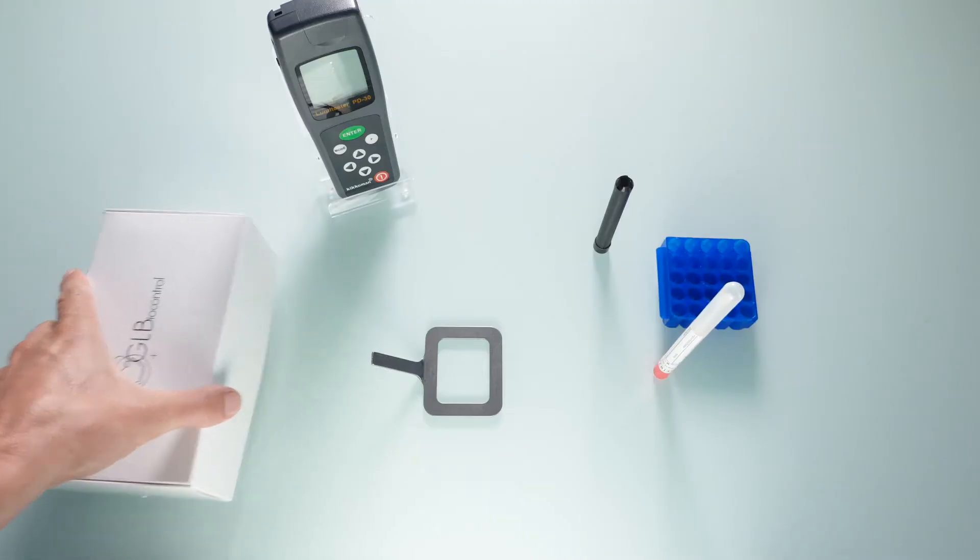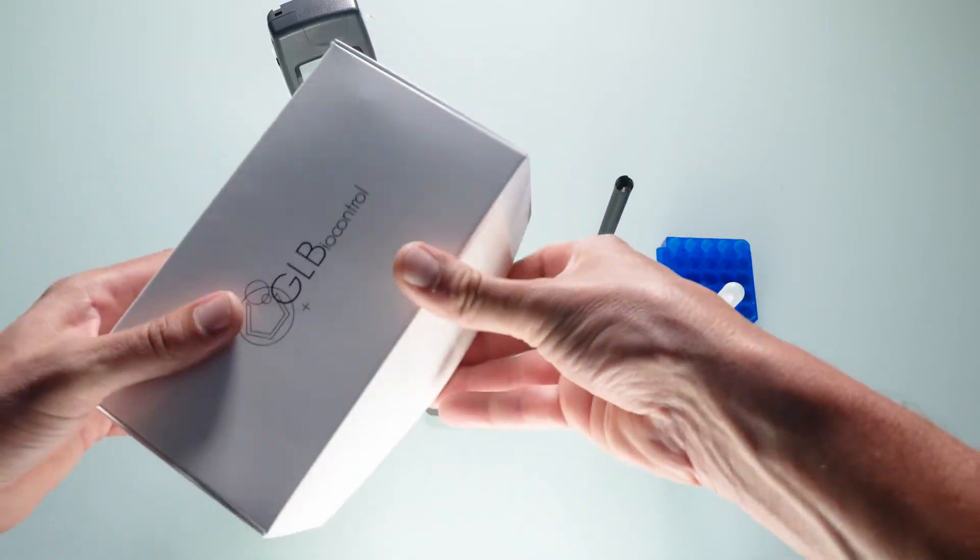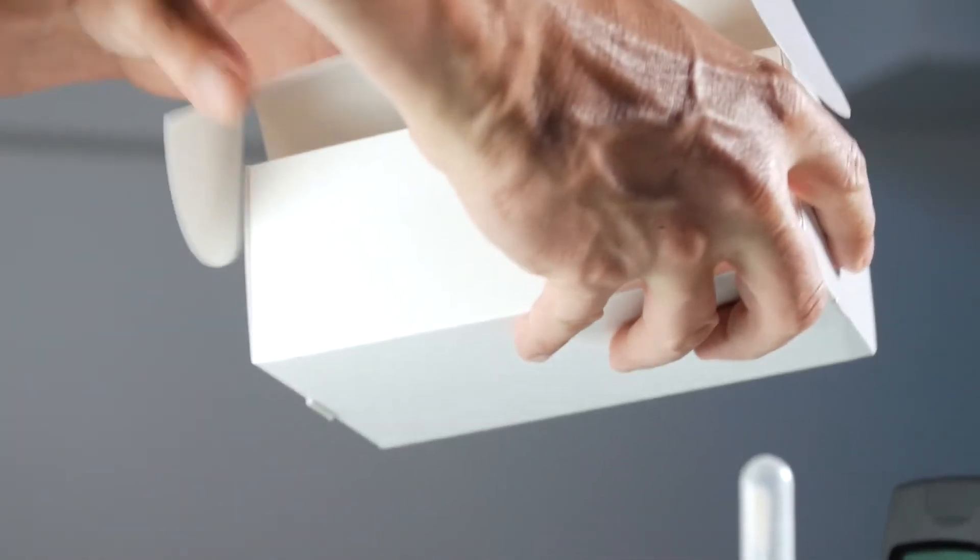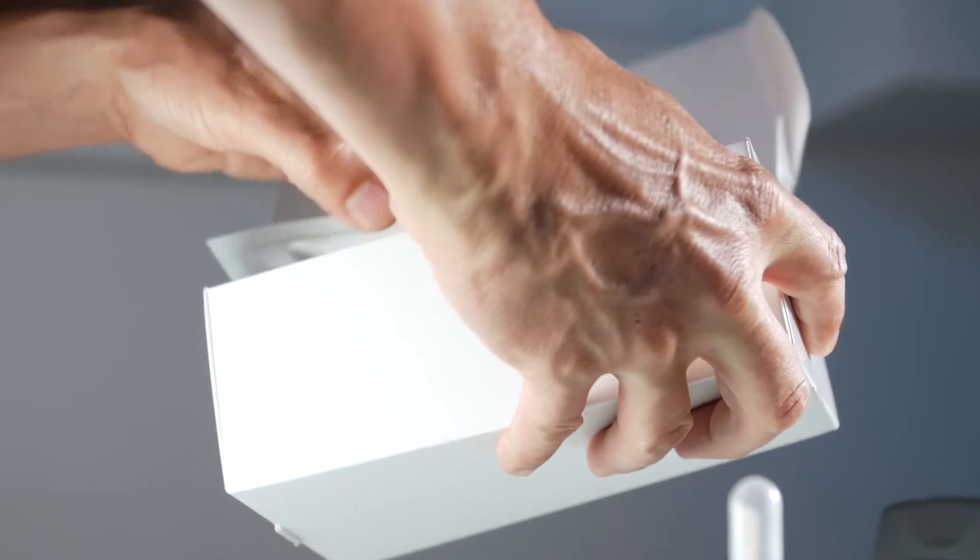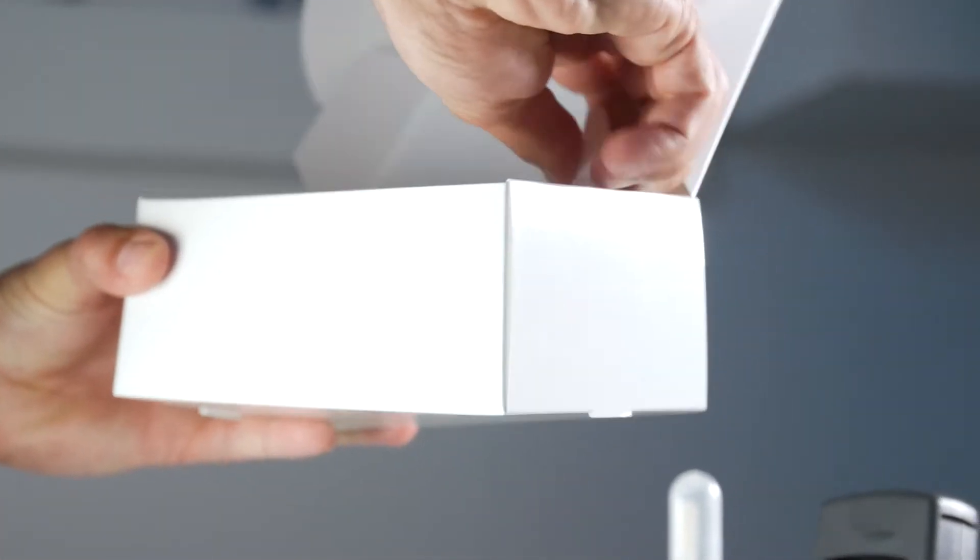Ensure the reagents are at room temperature before starting analysis. Open the box and take out a LumiTube pouch and the two reagent tubes labeled extractant and standard.